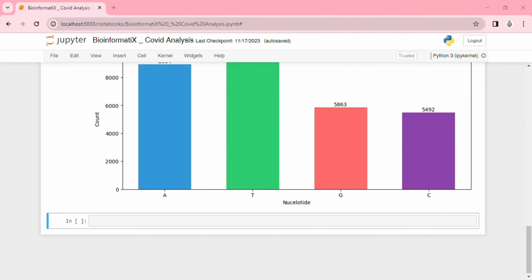But what are the applications of GC content? GC content is often used to identify potential protein coding regions, regulatory elements, or other fundamental elements within a genome. It can also be used for taxonomic classification and comparative genomics. Now let's calculate the GC content.